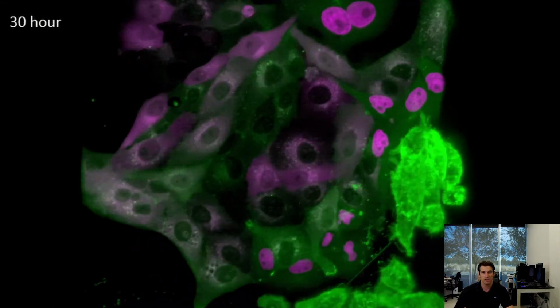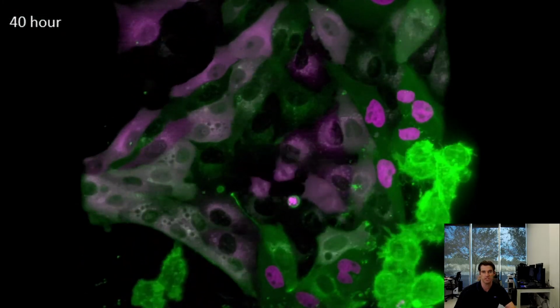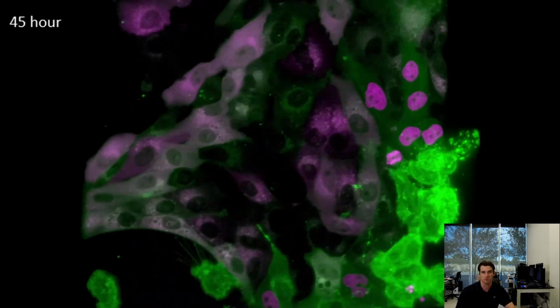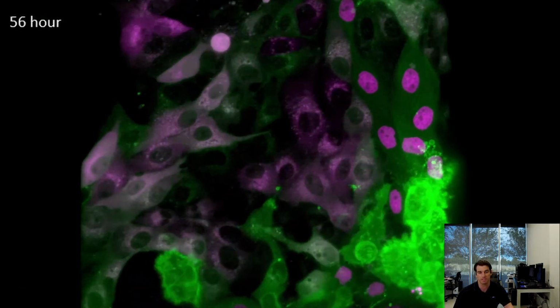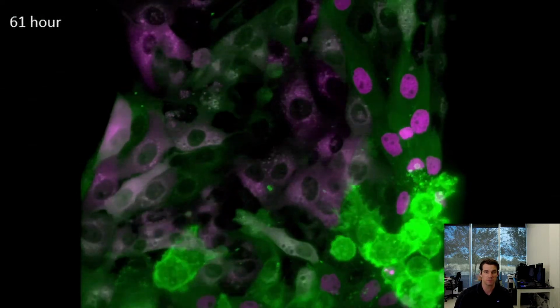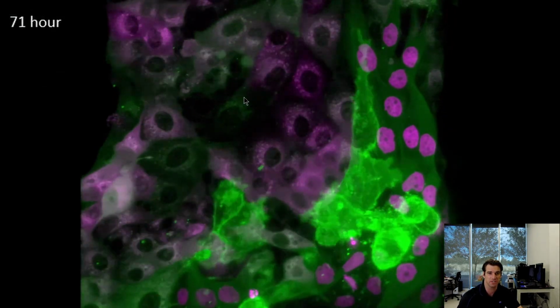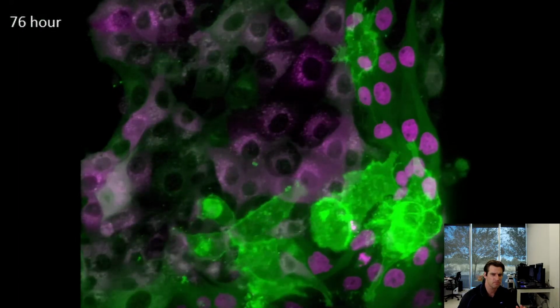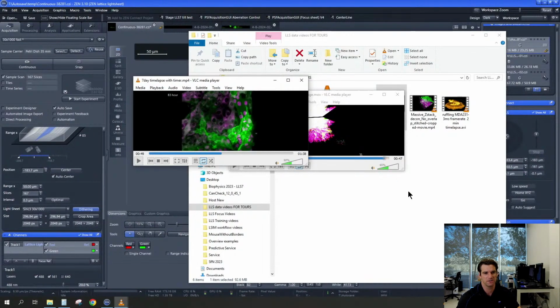So it's extraordinarily helpful to be able to get more time resolution in your videos, to be gentler, be able to image more often. And this translates also to being able to image very, very rapidly, being able to get 3 volumes per second when you're imaging a cell and getting all the advantages of being gentle, right? So how does this actually work? Let's talk about what the lattice light sheet is and what it's actually doing, right?